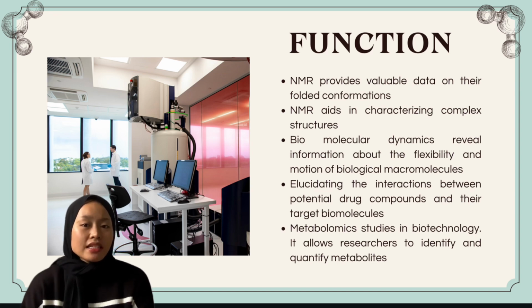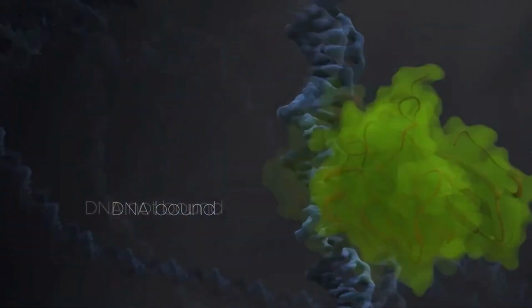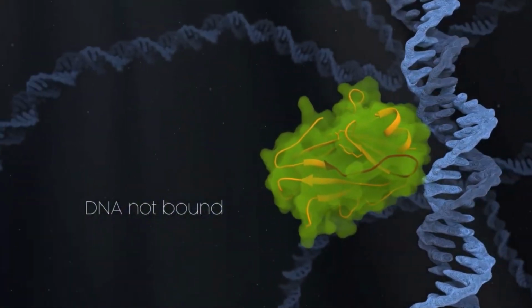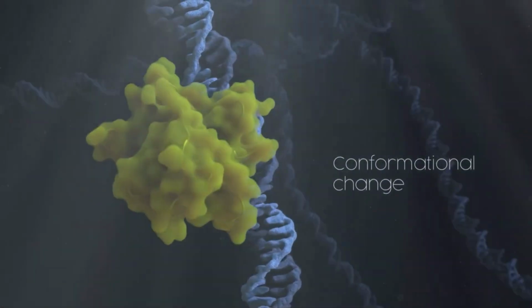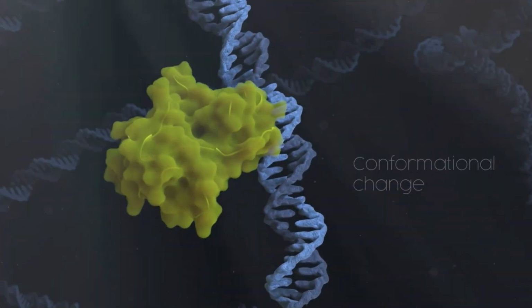Biomolecular dynamics is another key aspect where NMR excels. It can reveal information about the flexibility and motion of biological macromolecules. This dynamic perspective is essential for comprehending how proteins and nucleic acids undergo conformational changes during various cellular processes.